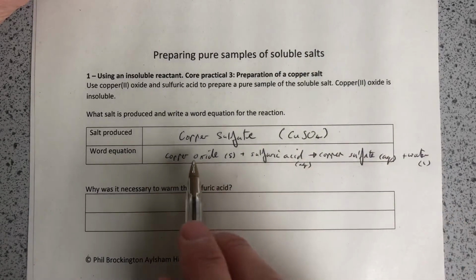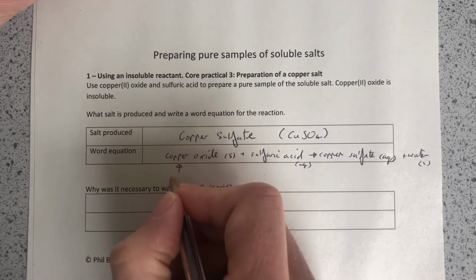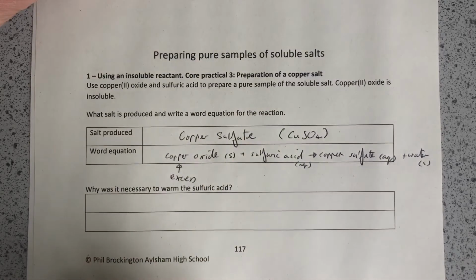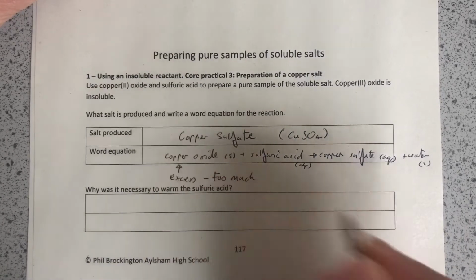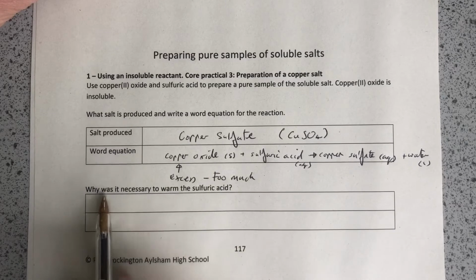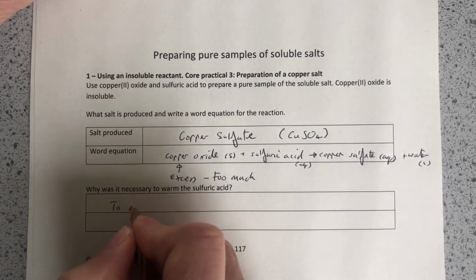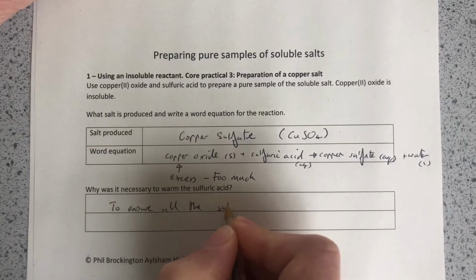To do this, the most important thing is we are going to use an excess of copper oxide. An excess means too much. So we're going to use too much copper oxide, add some sulfuric acid, react it, and we're going to warm it up. Why is it necessary to warm the sulfuric acid? To ensure all the sulfuric acid reacts.